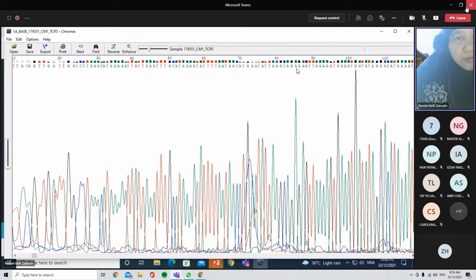Okay, if you look macam A ni, dia tak nampak kat background, it's very sharp. So there you have a very good concentration of A at that position. Macam ini dia very weak kan. Okay, pasti yang weak ni you kena tengok lah, meaning that the laser actually, they are not 100% sure that this is A. So you have to check.